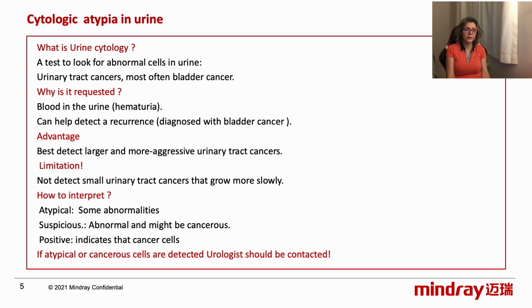How to interpret: atypical, suspicious, or positive? If atypical or cancerous cells are detected, urologists should be contacted.